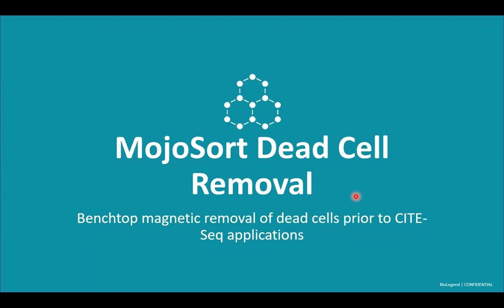Another thing I want to talk about is the MojoSort dead cell removal kit.